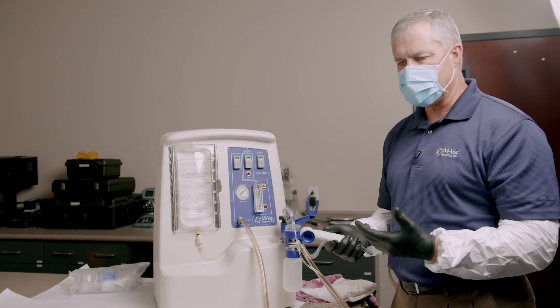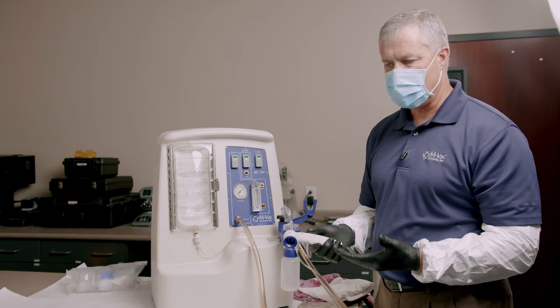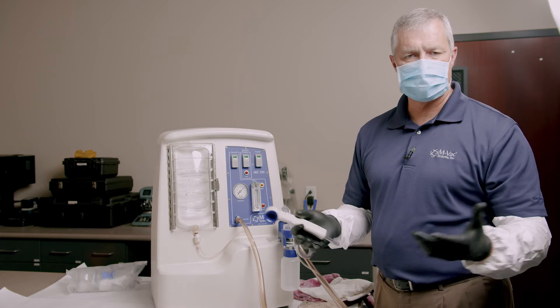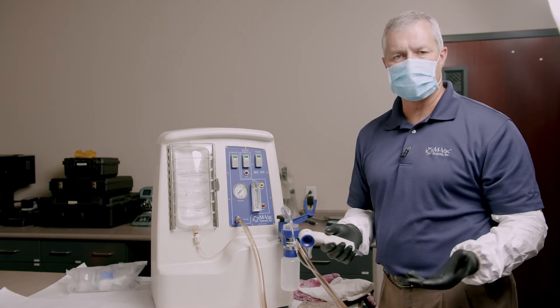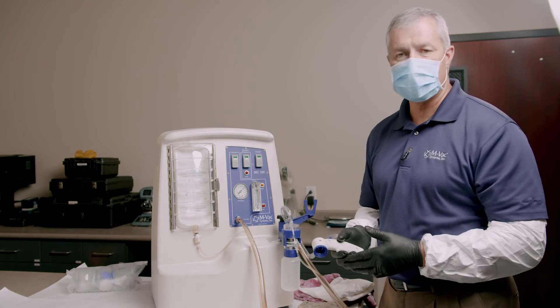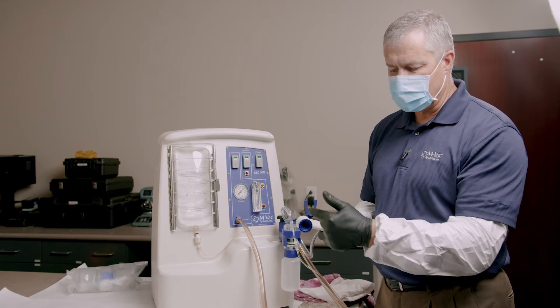If you wanted to compare it to a carpet cleaner versus a broom — say you're trying to clean a stain off your couch and your kids spilled some Kool-Aid on it — once you tried the rag and the rag couldn't get the entire stain up, you'd have to get something like a carpet cleaner. That's really the concept behind the MVAC and why it works so well. Again, it sprays in the middle and vacuums along the outside.